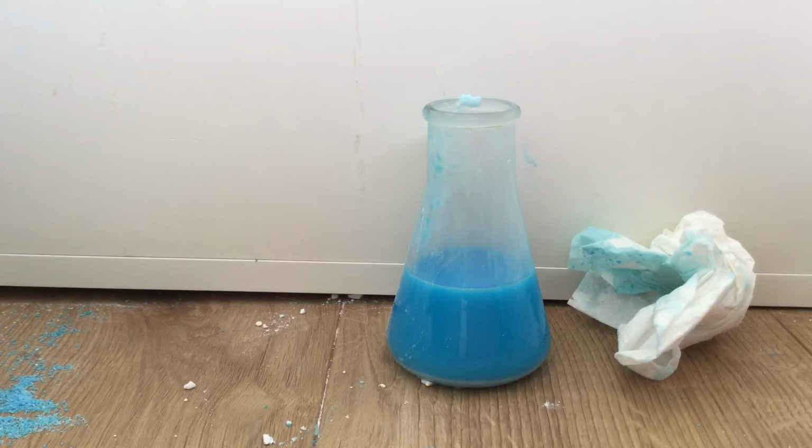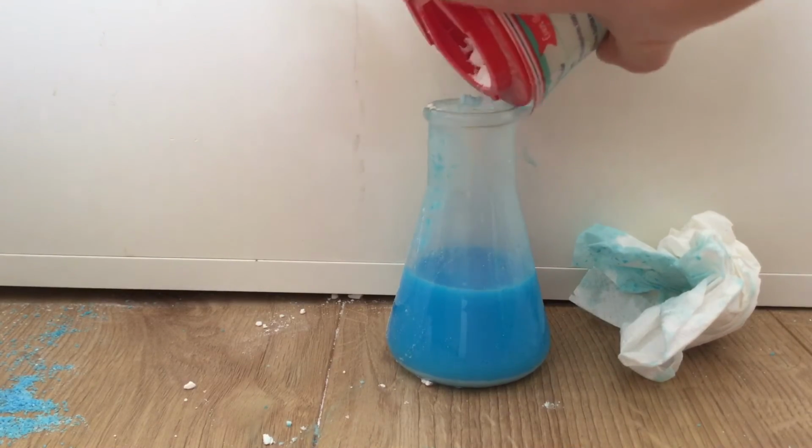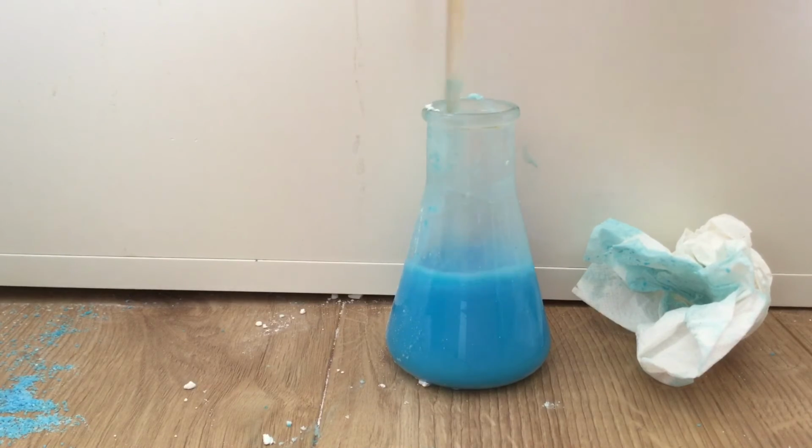Now that it's separated out a lot, you can definitely see on the bottom there's much lighter blue. And it's done. And I just need to mix it in, and that's what you should have once you finish this stage. I wasn't planning on it taking 8 minutes, it did.